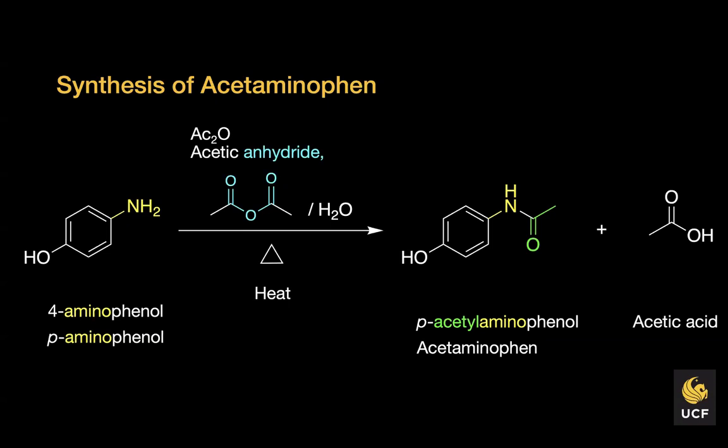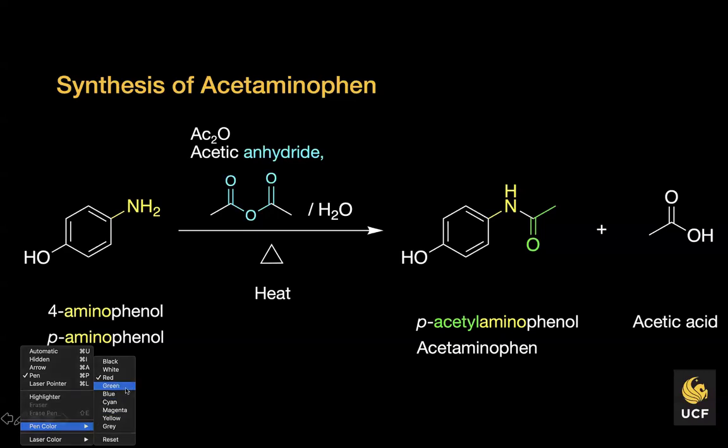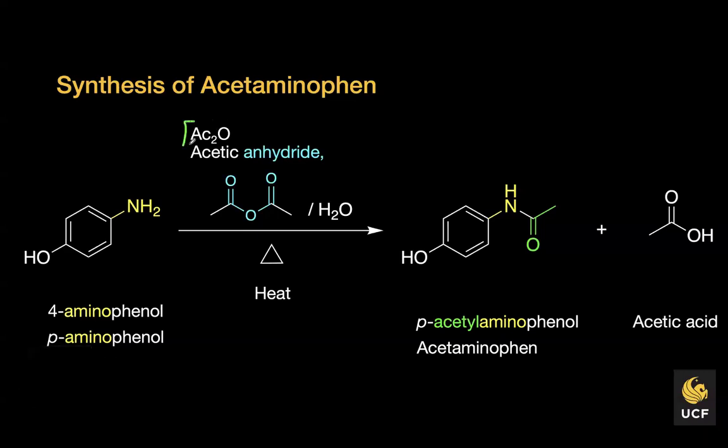In this particular experiment, it involved the synthesis of acetaminophen, starting from 4-aminophenol and reacting that with acetic anhydride. You may see throughout that I abbreviated acetic anhydride.